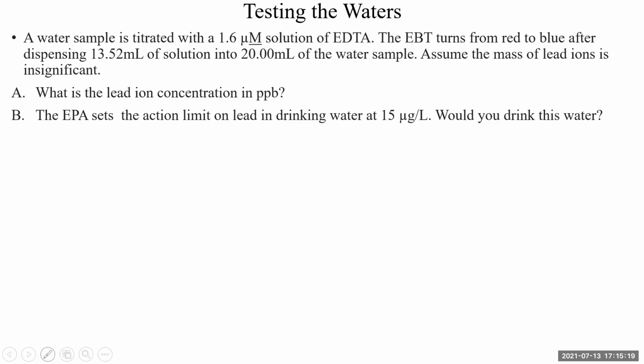So let's do this. First, we have a 1.6 micromolar solution of EDTA.